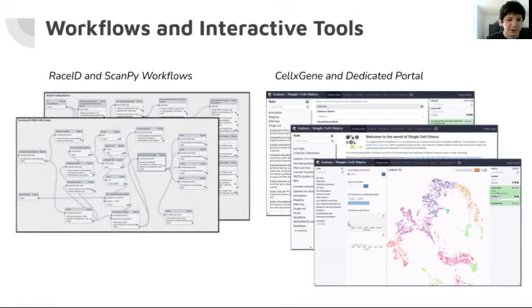Each of the single cell tutorials comes with a corresponding workflow and we have dozens of these to accommodate many different analysis strategies. As you can see they are highly configurable with an intuitive drag-and-drop interface facilitating a branching analysis style that can make use of the 8000 processing cores and 1.5 petabytes of storage that we have for the Galaxy Europe instance here in Freiburg.